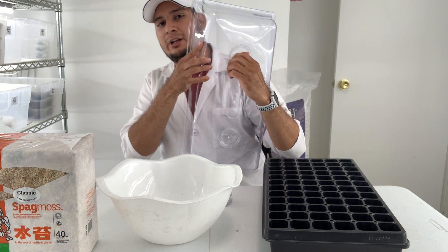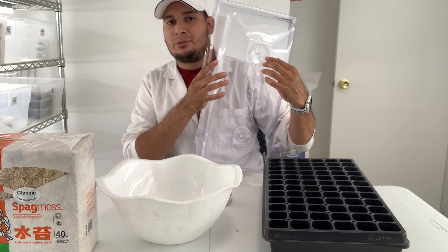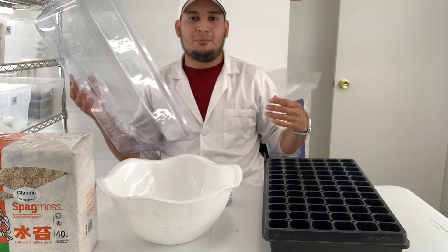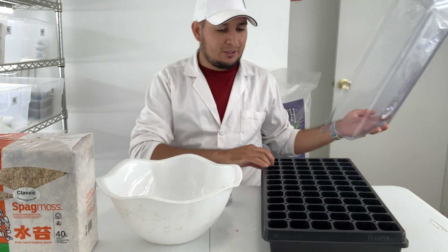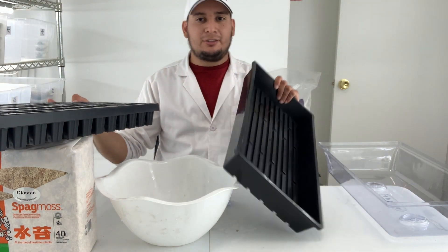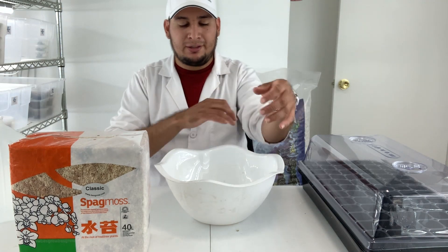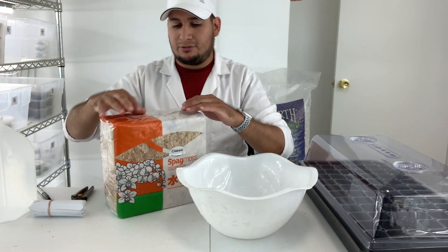Whenever I want to put the plants in there, I want the dome to be closed, but after a few days I want to open it slowly every couple of minutes every day, until I can keep it completely open. Then after that I can completely remove the dome and leave the plants to acclimate to lower humidity. Today I also have a heavy-duty 10 by 20 flat tray. First I want to make my media mix.